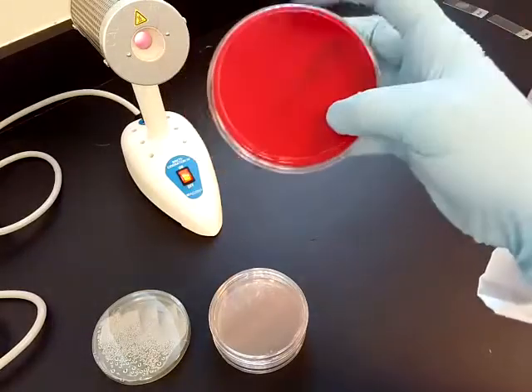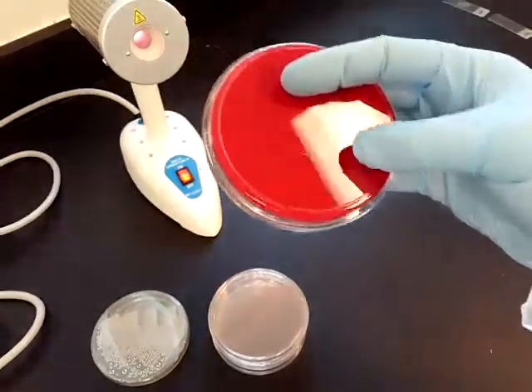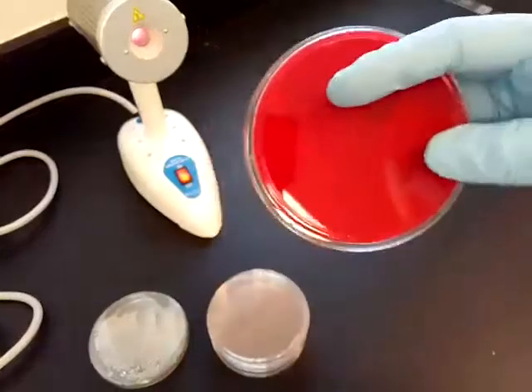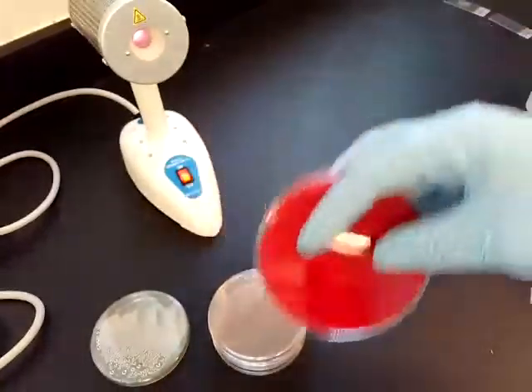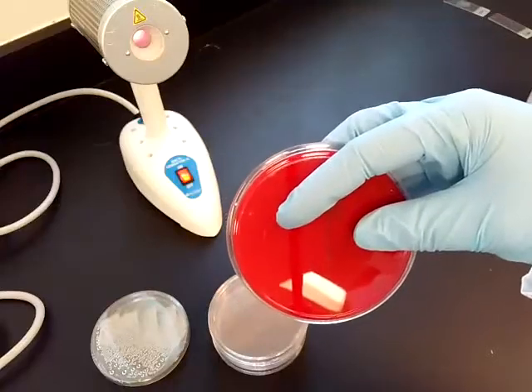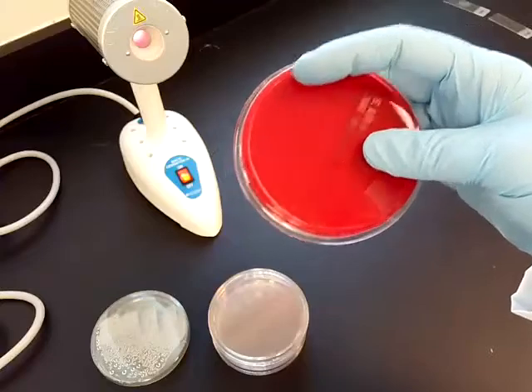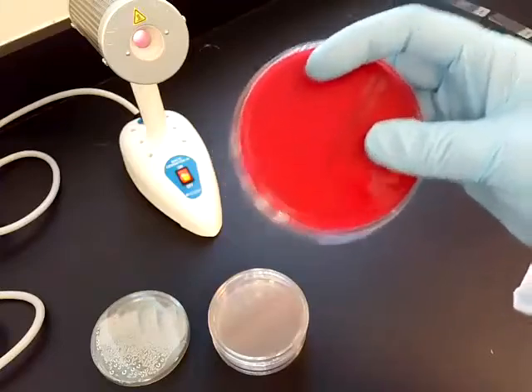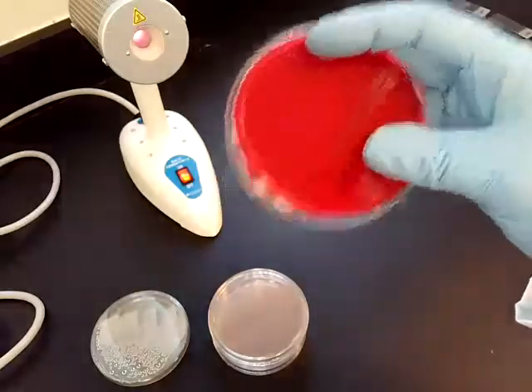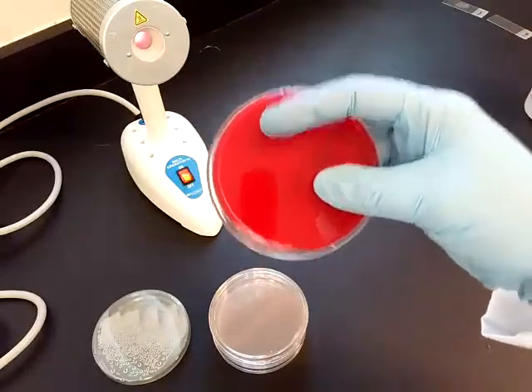In alpha hemolysis, you're going to see a greenish color around. If you recall the breakdown of hemoglobin from possibly previous classes, it's broken down into biliverdin and then eventually bilirubin, which has a yellow color. So biliverdin has a green color, that kind of moderate breakdown or digestion, that medium hemolysis that you would see from some microorganisms, that's alpha hemolysis.